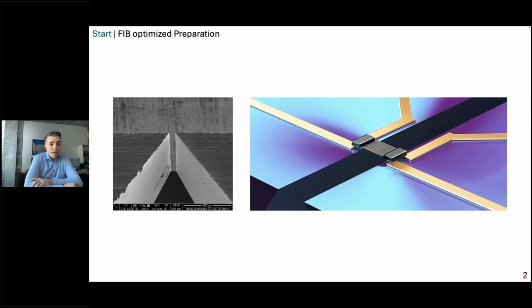It was the first MEMS chip which was not membrane based, so a chip without the silicon nitride membrane. Here you can see it is a slot in a silicon die, and you have your contacts on the top, and they're physically separated. So there's no way of shortage, and from the front side, you can easily mill the specimen. So I thought, okay, every problem is solved. We can now do proper biasing.